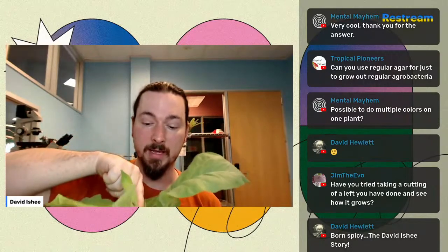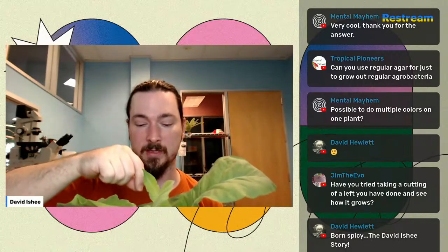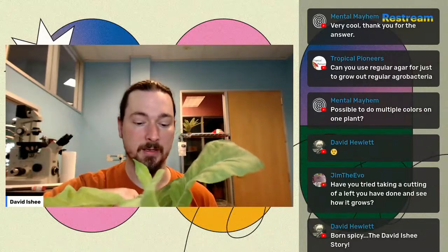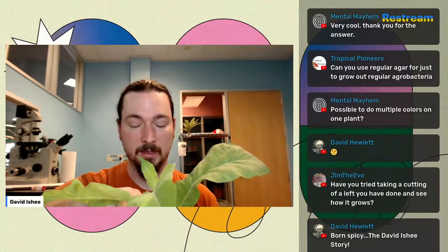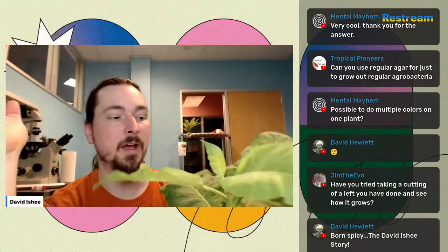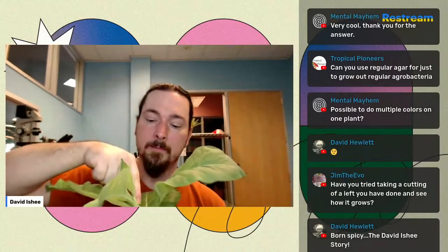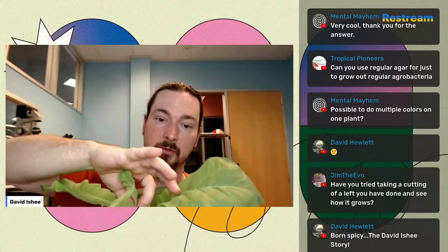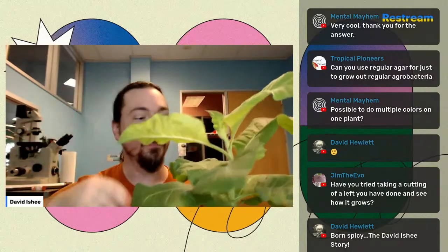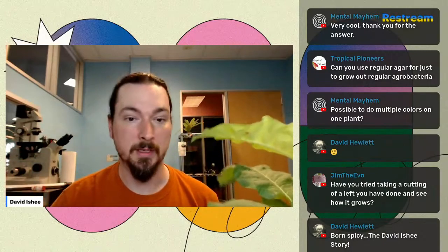Now, I have tried cutting into the node and trying to agroinfiltrate the node itself. I've tried injecting the node with like a syringe. I've tried infiltrating and injecting the stem itself. I've tried a dozen different variations on how to do it. I've tried where I infiltrate the node and then cut the growth tip off, because when you cut the growth tip off, it causes a hormonal change in the plant. And that causes each of these nodes to start producing new growth tips, right?